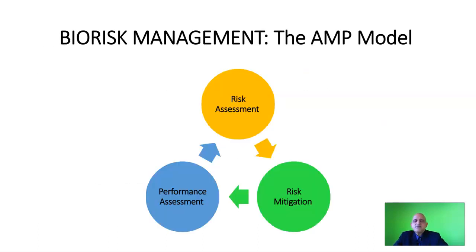In biorisk management, we follow the AMP model, which will form the basis for the rest of the lectures in this MOOC. The AMP model begins with risk Assessment (A), then risk Mitigation (M), and finally Performance assessment (P). This process is cyclical and continuously improved upon in order to mitigate risks.